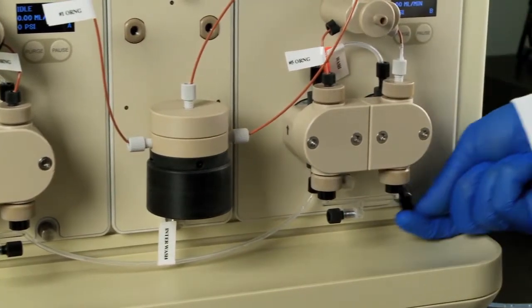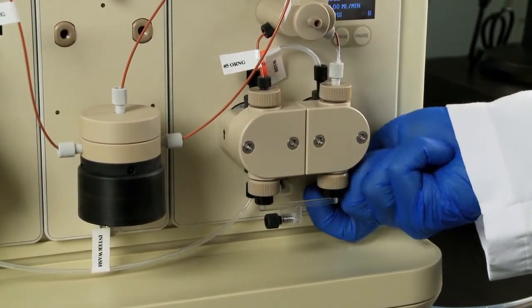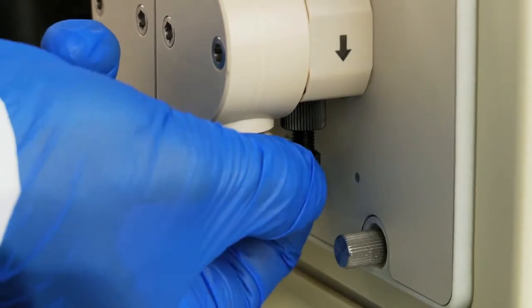Next, attach the pump wash priming line to the System Pump B wash outlet, right-most bottom port.